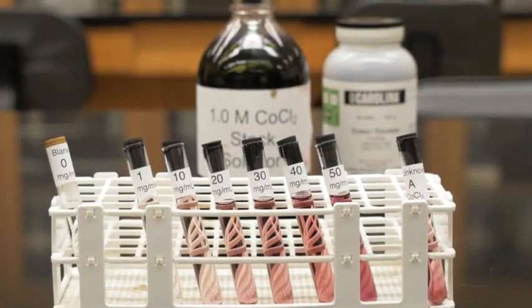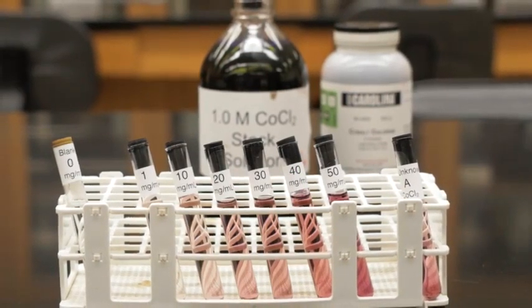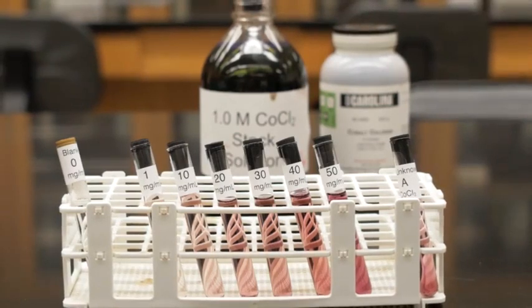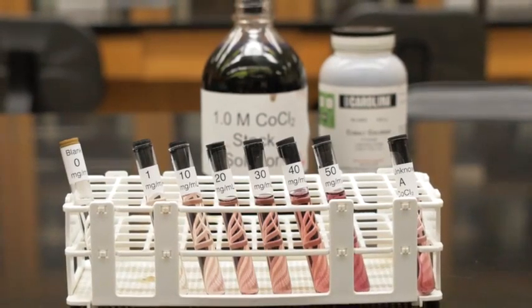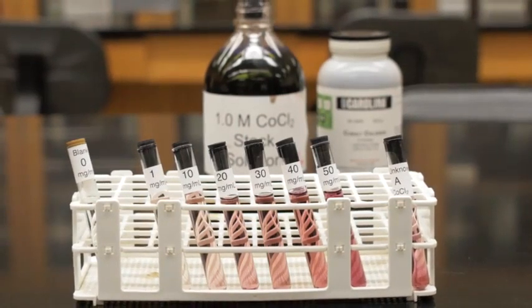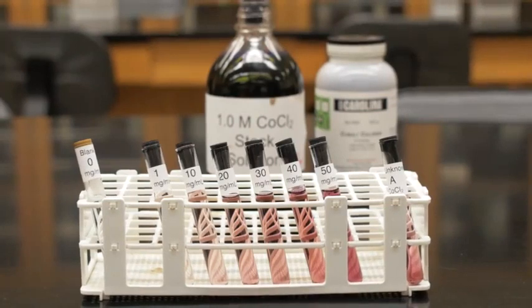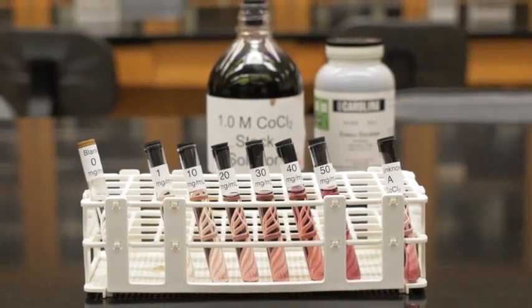Our standards include these 6 dilutions of the stock solution. Also provided is a blank with 0 concentration of cobalt chloride. We'll use this blank to calibrate the spectrophotometer. To recall how to make these standards, review the accompanying video on preparing serial dilutions.